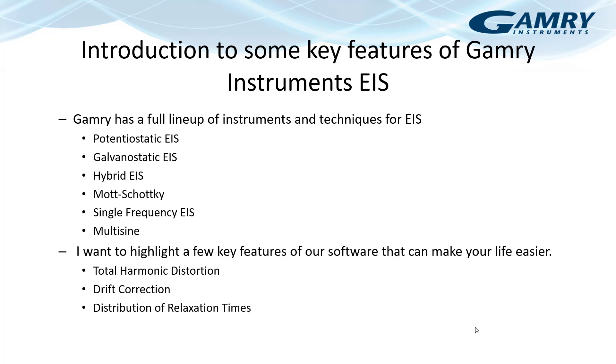So in this short video, I just want to highlight a few key features of the software that can make your life easier. Those are total harmonic distortion, which is a way to measure non-linearity in your cell's response. Drift correction, which is a way to correct for your cell's voltage drifting. And also in terms of analysis then, I want to show you a function called distribution of relaxation times, which is a method to convert frequency data into time domain data to help you identify how many RC time constants you might have.